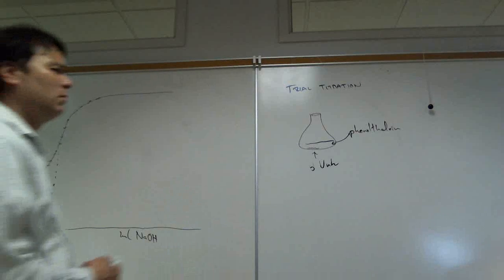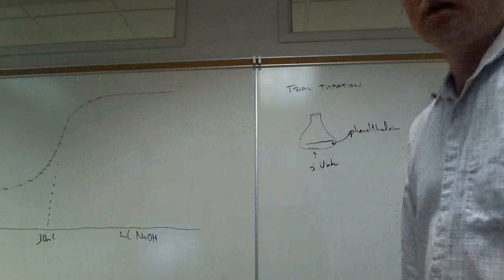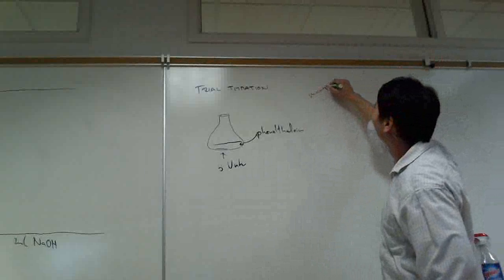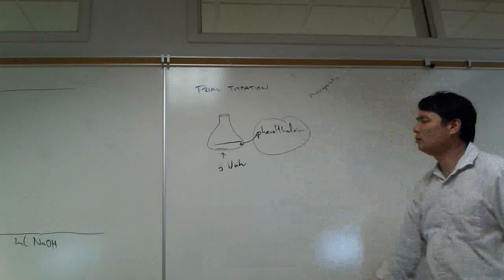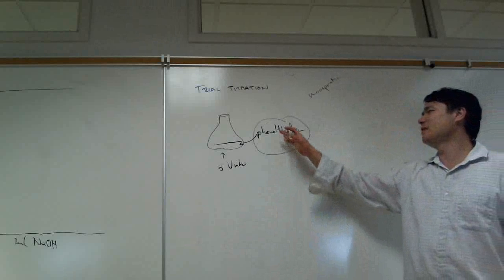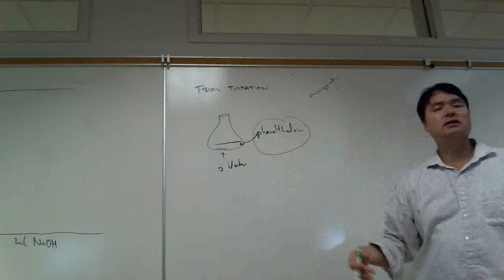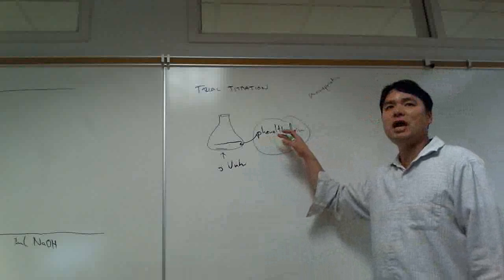And so when we titrate this with phenolphthalein, if we have monoprotic acid, we're titrating it to the equivalence point, because if we have a weak acid, let's take a look at phenolphthalein. Phenolphthalein changes color around what pH? Yeah, the pKa is about 9, so the color change, where it's a mixed, intermediate color, is from 8 to 10, pKa plus or minus 1. And so this is going to start turning light pink at about pH 8.